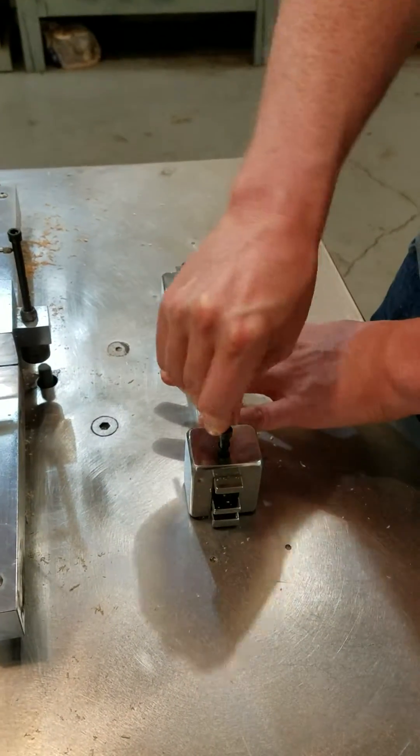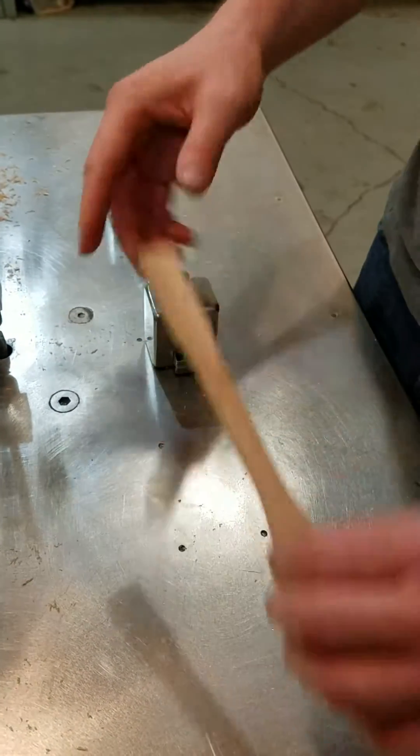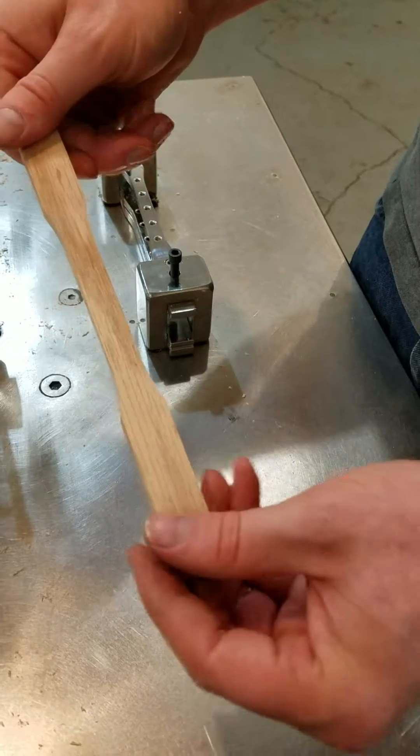Just loosen your screws up a little bit — the sample comes right out the end. And there's your little Type 1 sample.